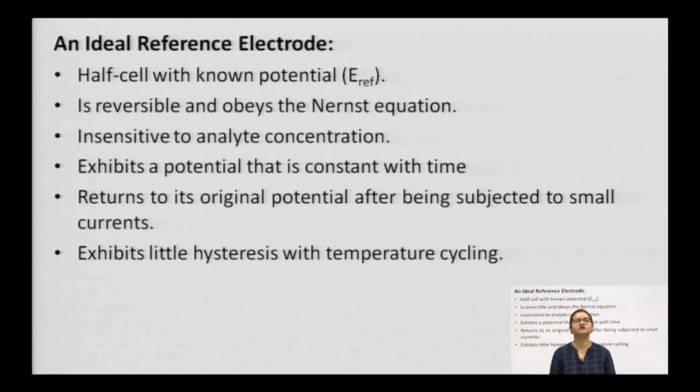Another ideal characteristic of a reference electrode is that it is insensitive. This is a very important condition. It should be insensitive or stable to the analyte concentration. Then the next important ideal characteristic of a reference electrode is that it exhibits a potential that is constant with time.